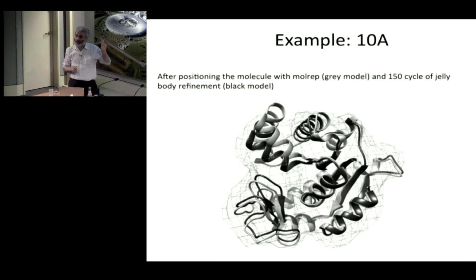This technique assumes that the starting conformation is sufficiently correct. If the starting conformation is not correct, then this type of tool may not work as well as you would like, because the tool tries to keep starting conformations intact. Okay. So when you build a model, you should make sure that the conformation is as correct as possible. Then you can use this technique. Otherwise, this technique cannot be used.